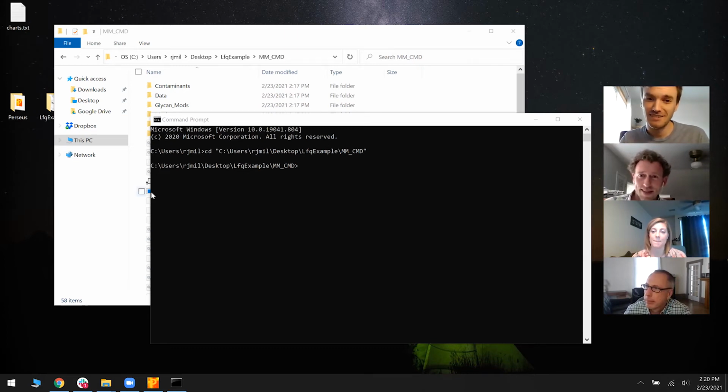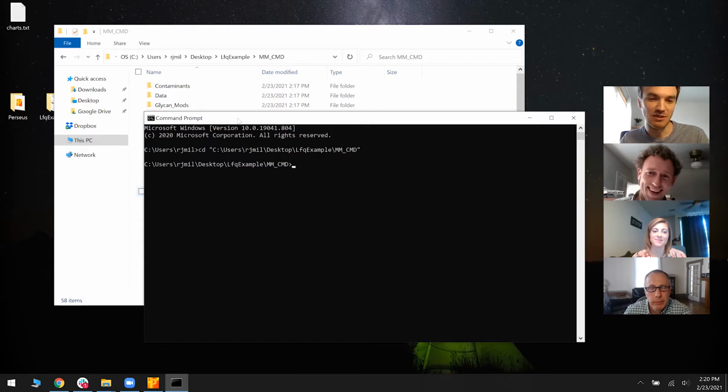All right, CLI. Yeah, let's do it. All right. So I have a command. This is a Windows command line, but you can also run it on Windows and Linux and Mac. Kind of explain that in a second.